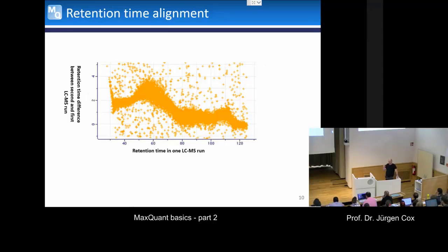However, the matching time window has immediate consequences on the false discovery rate, right? Because that actually goes down linearly if you shrink the matching time window. So that is really beneficial if you adjust this to your data. And you would adjust this to your data by looking at the width of this data cloud here. Right.